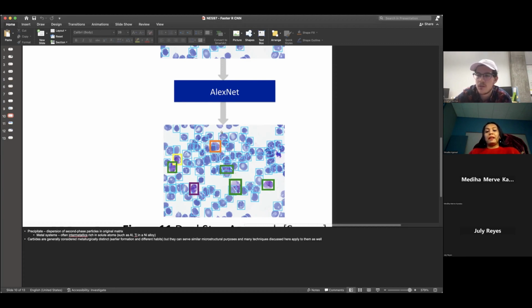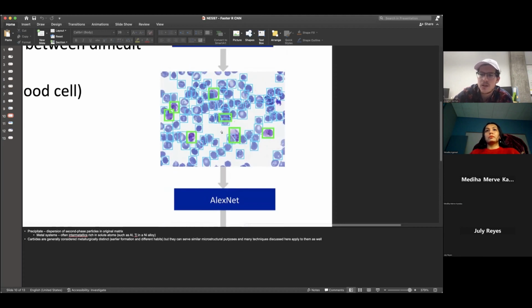And if we apply this faster RCNN to our bubbles data, what do you think? Do you think we would do a similar approach, applying AlexNet and faster RCNN, or could it be directly applied? I don't see why the second step would be necessary, because as demonstrated here, faster RCNN did an excellent job of identifying a binary yes/no criterion.